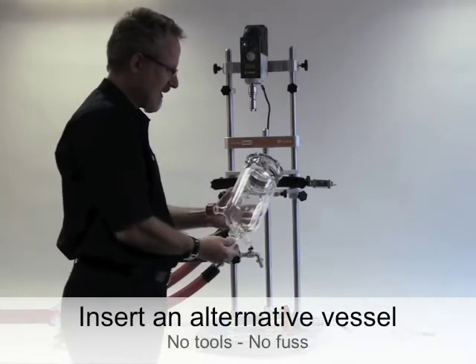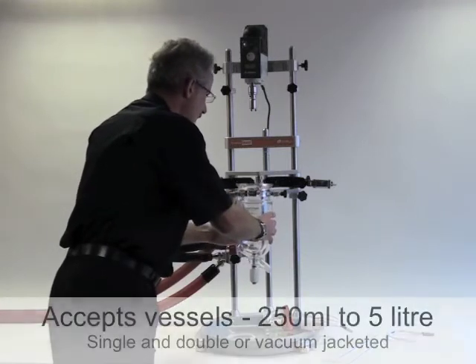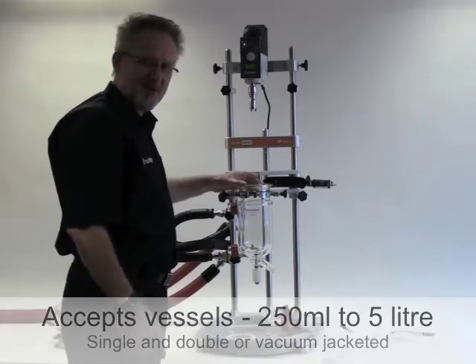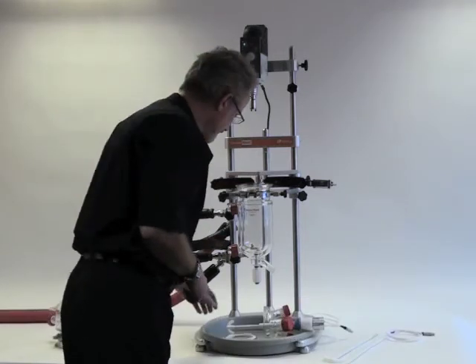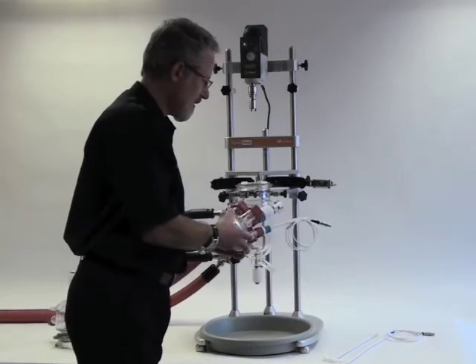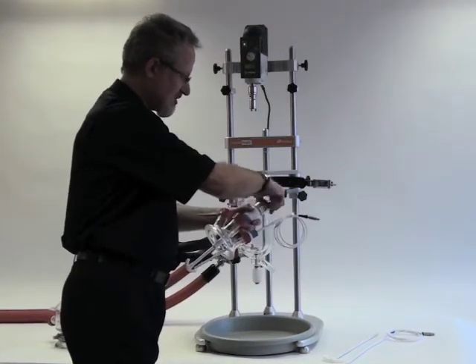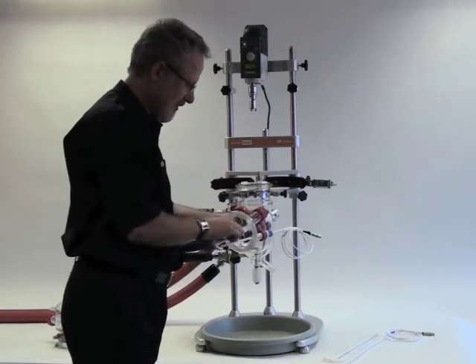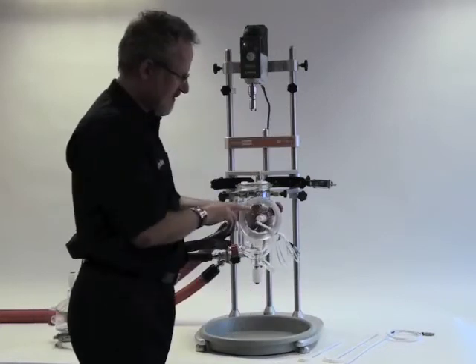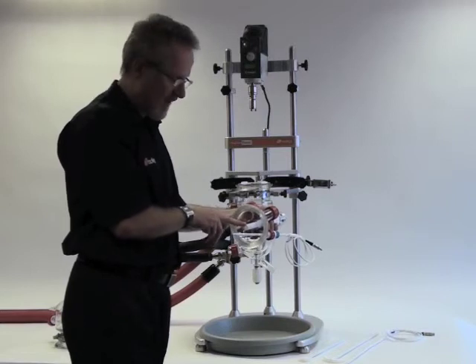Now I'm going to replace the vessel with this one litre single jacketed vessel. The vessel is supported — it's a one person operation. As I now have a larger vessel in place I need to change the stirrer shaft and temperature probe. You'll note that the stirrer guide is extended here, which provides support for the stirrer shaft to prevent whipping.